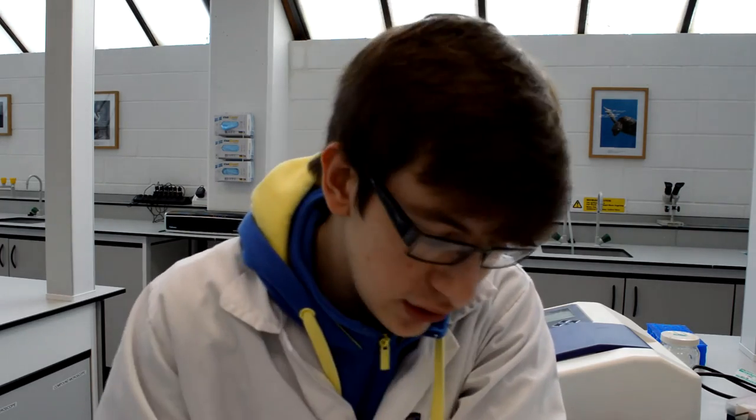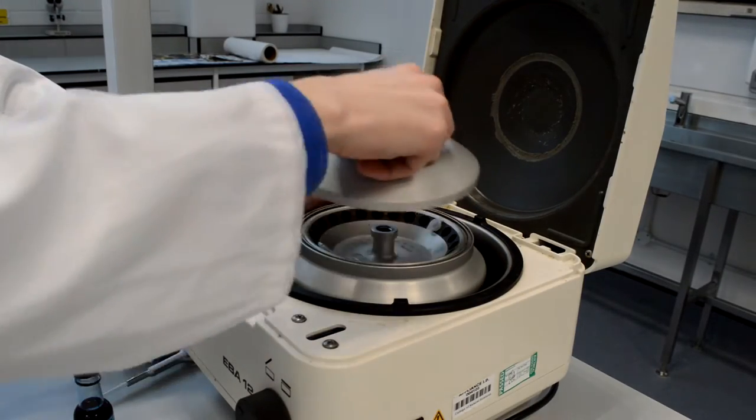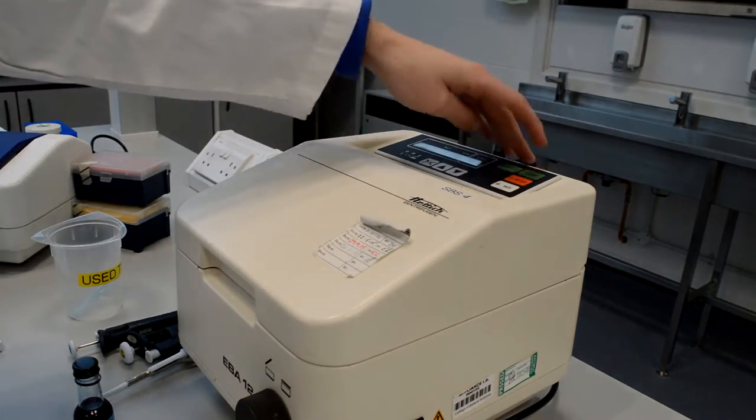Now, as far as setting up a centrifuge goes, it's really simple. First off, you get your solutions in your little Eppendorf tubes, and you're going to put them into the centrifuge. Following that, you put the top cover onto the centrifuge and then you turn it on. It is really as simple as that. There's a couple things that you need to make sure that you do so that you don't end up breaking the centrifuge. First off is always make sure that you balance the centrifuge.